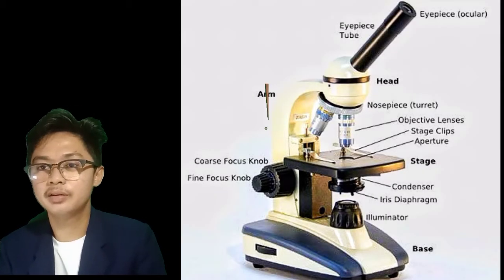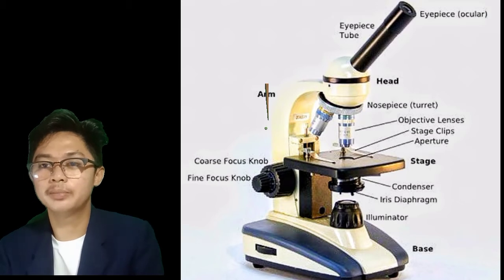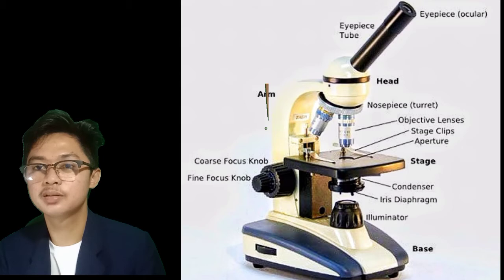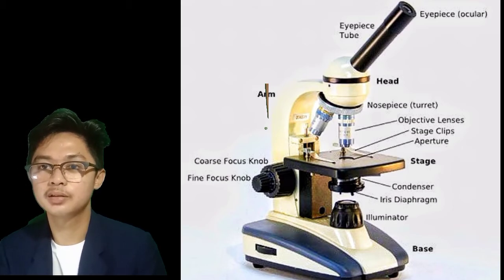We have here a figure of a compound microscope. As you can see, these are the parts. There are the optical components and the structural components.